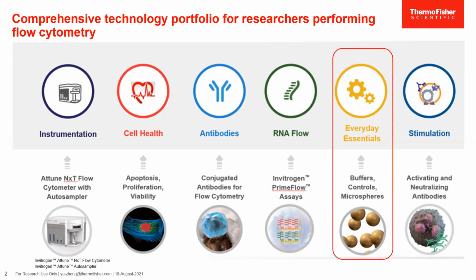These microspheres are mainly synthetic polymer particles, mostly polystyrene, with or without cross-linker. Based on the application, these can be plain white particles or loaded with single or multiple fluorescent dyes.